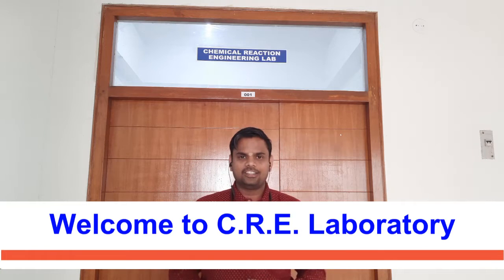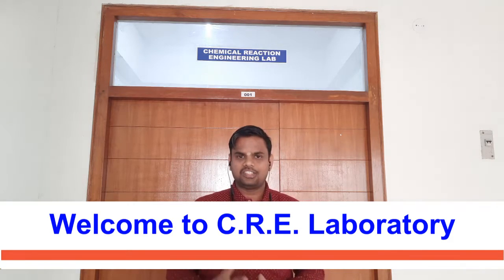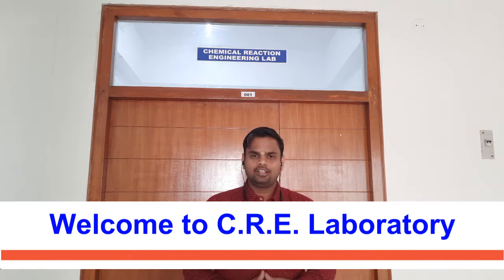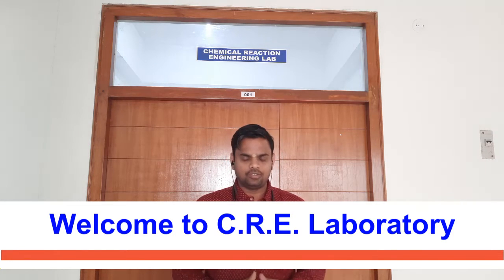Welcome to Chemical Reaction Engineering Laboratory. In the past 3 weeks, we have done 3 experiments: ideal batch reactor, ideal CSTR and ideal plug flow reactor. So this is the 4th experiment we are going to perform and demonstrate to you all today.